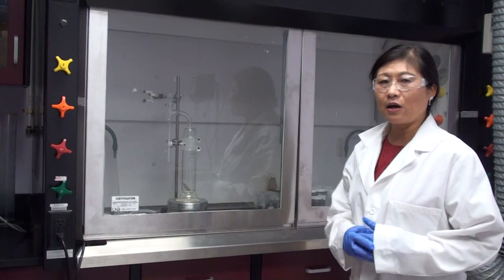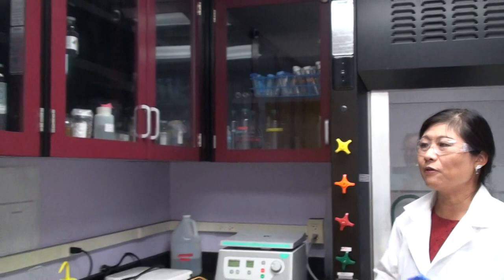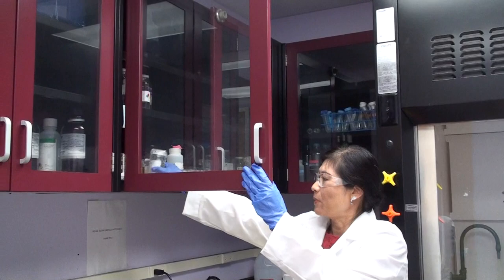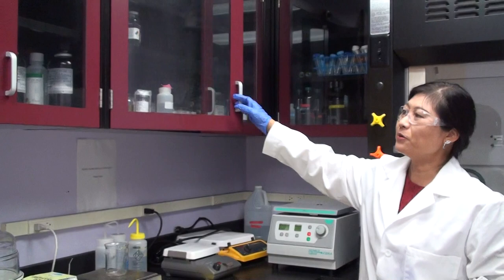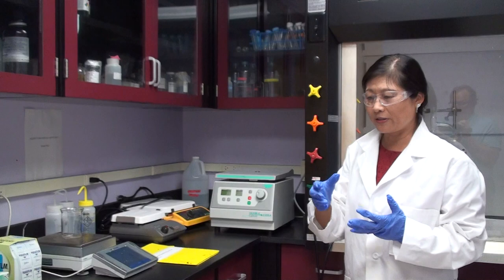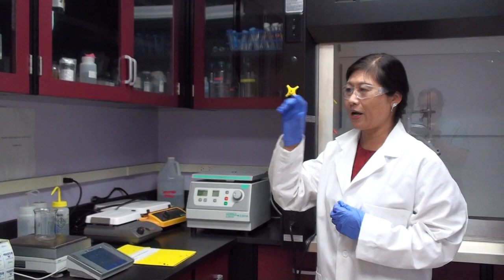And we do have some chemicals storage here. All of the chemicals, they are surfactant, for example here. And we also have some polymer solutions. So those chemicals, they already provided the safety sheet in our drawers. So no worries, if you want to test the data over there, you can find it.